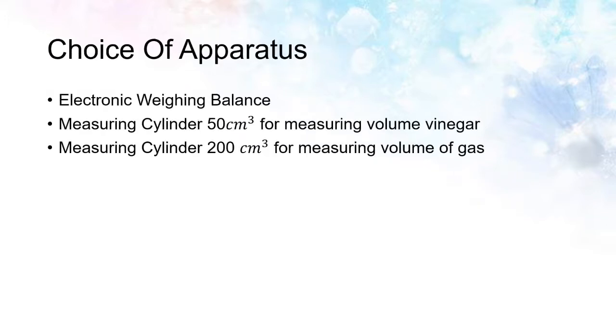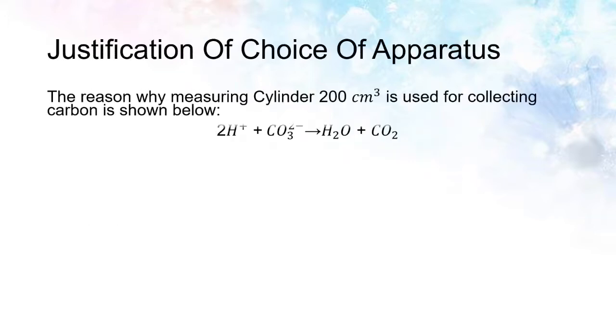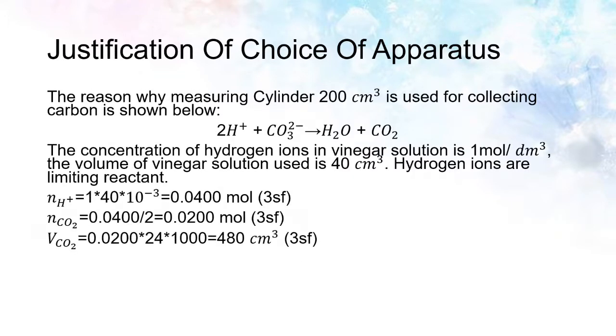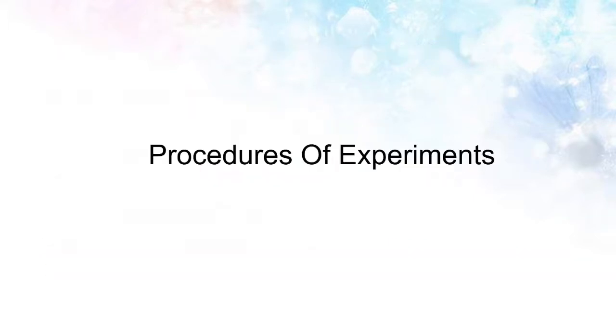Our choice of apparatus is shown here. The following is the reason why we chose the 200 cm3 measuring cylinder.